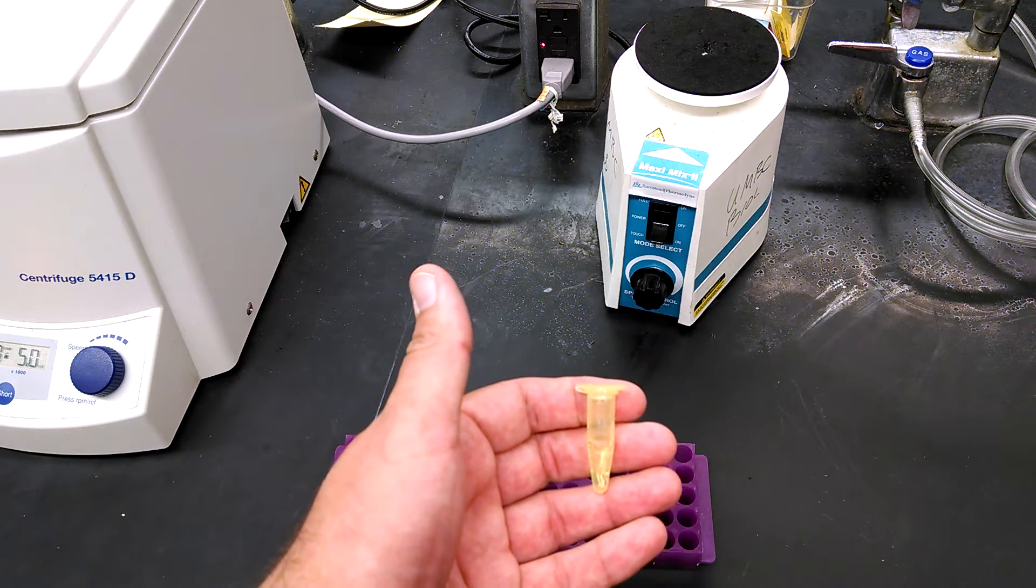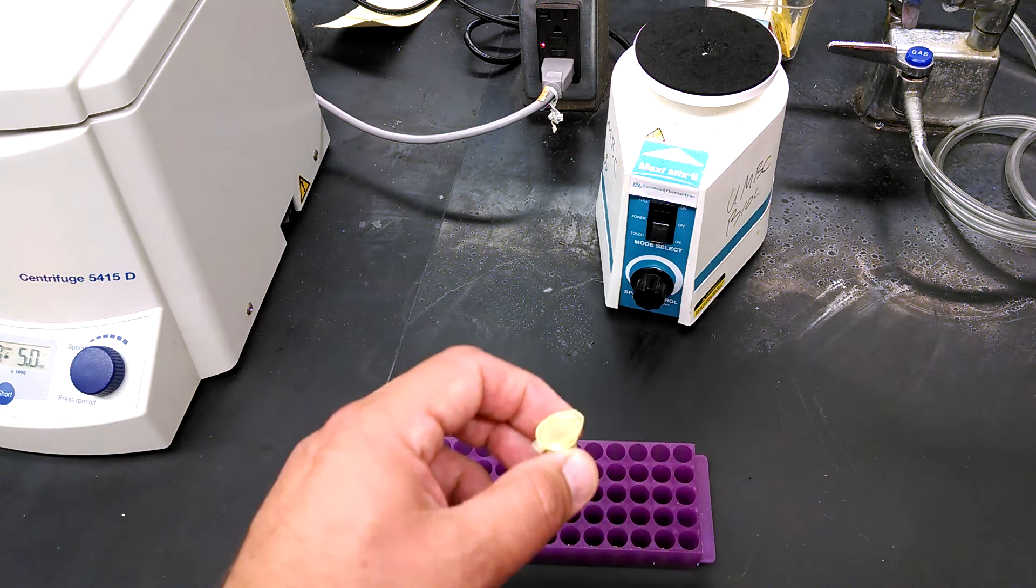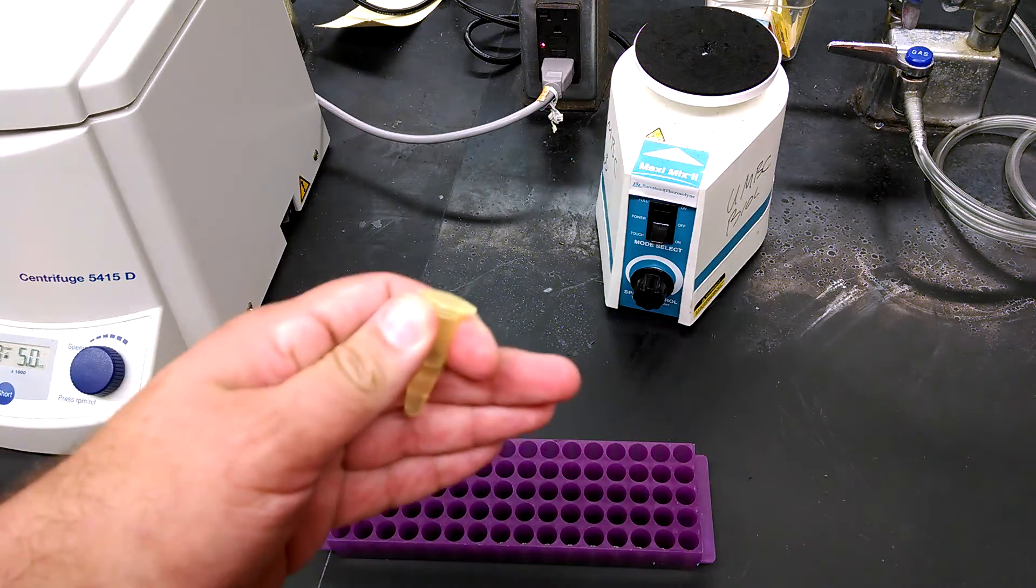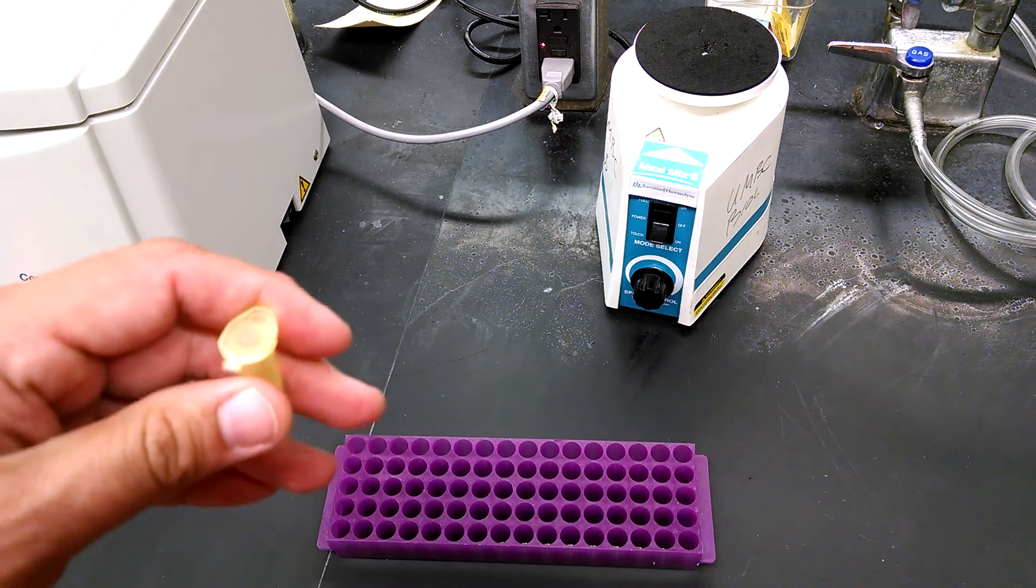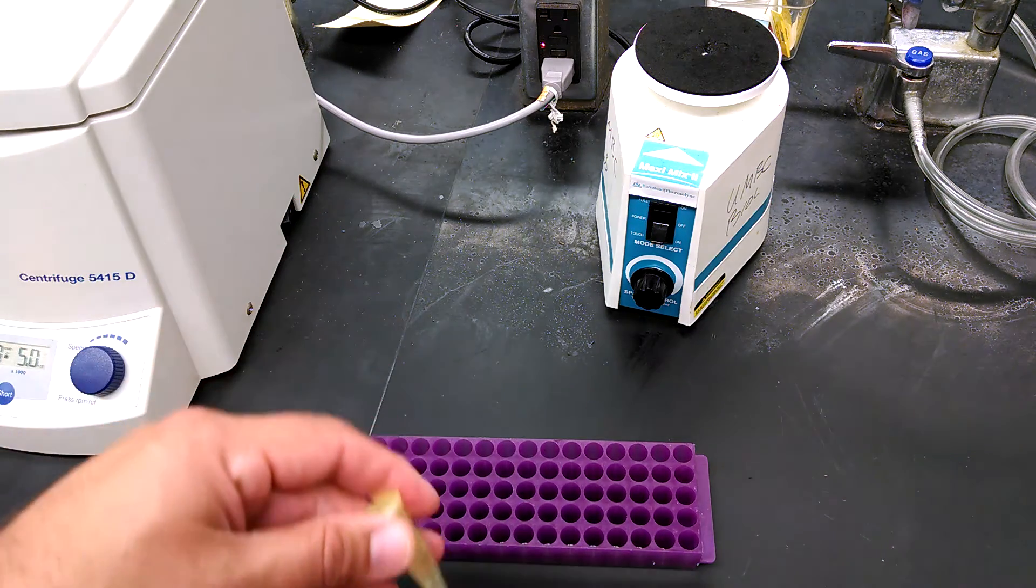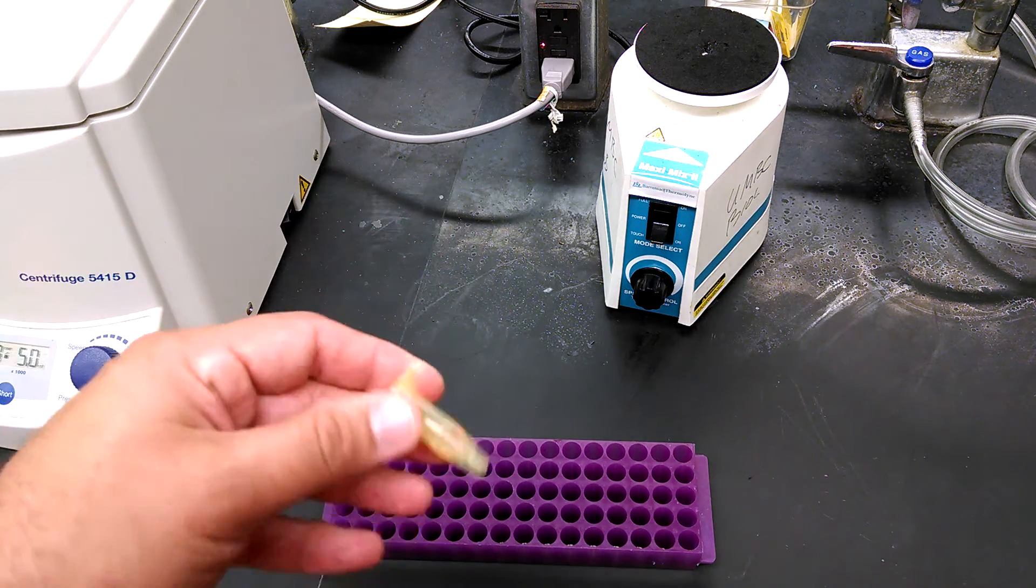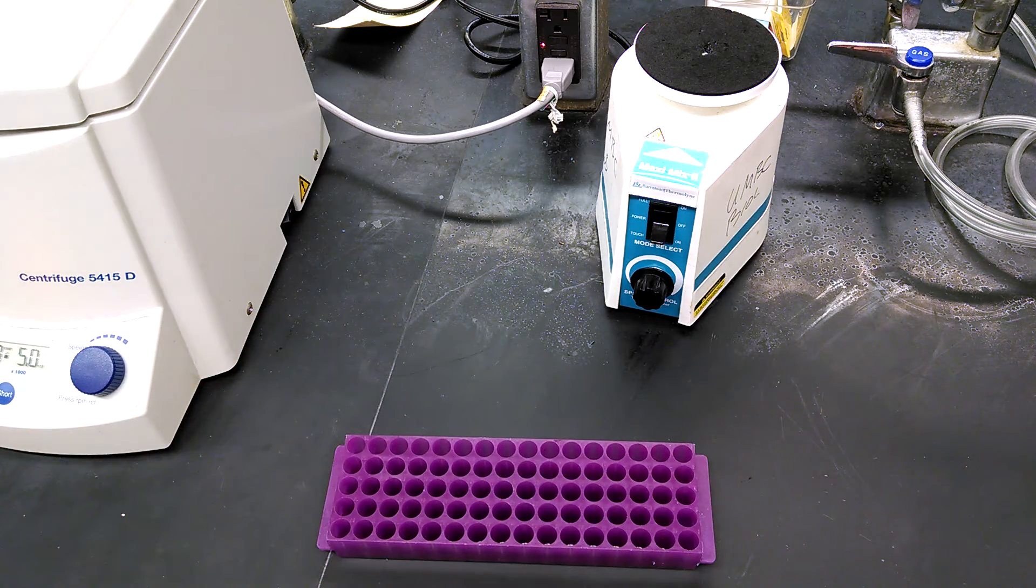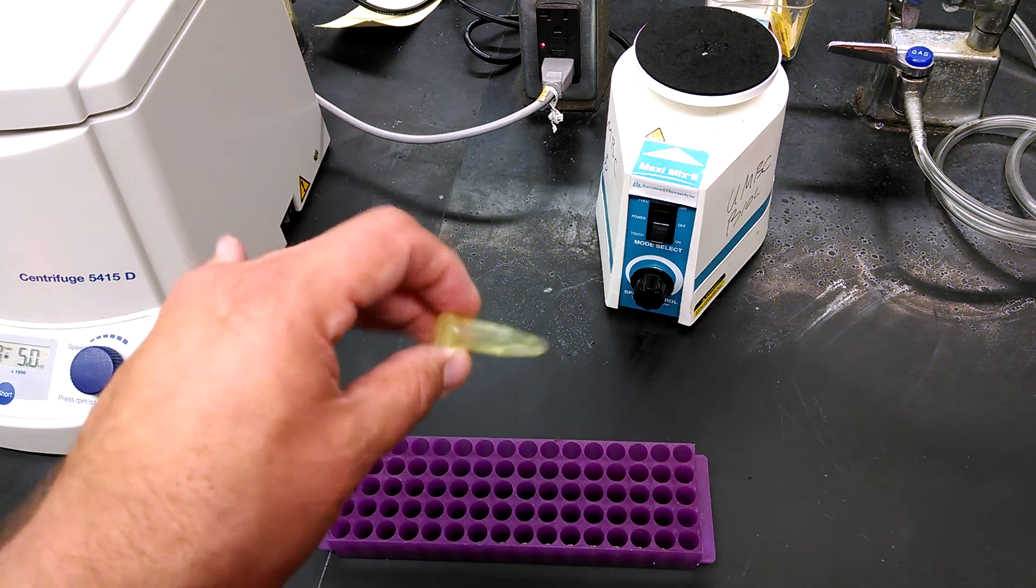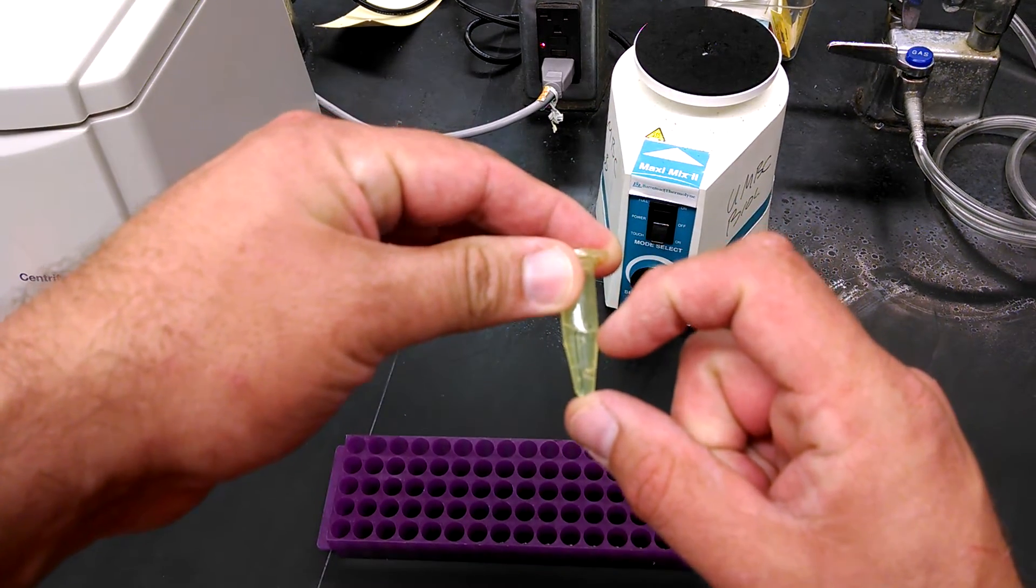Now we need to break these cells open and access them. So what you're going to do is centrifuge these following the procedure in the lab manual, and then you're going to add them to Instagene. Once you add them to some pre-prepared Instagene tubes, which will come to you in a tube looking just like this with about 200 microliters in the tube.